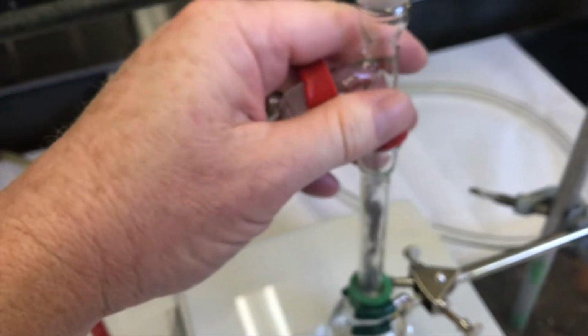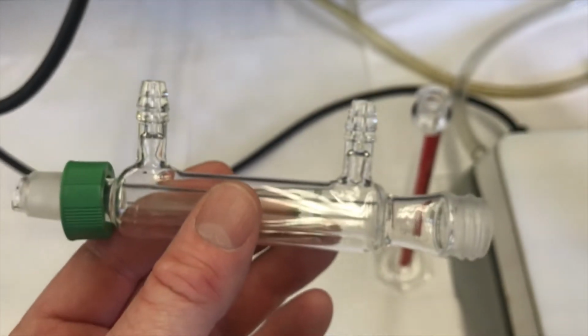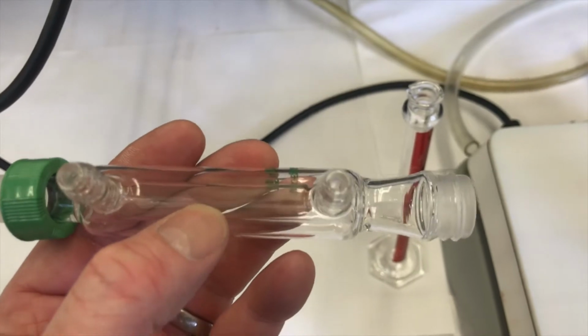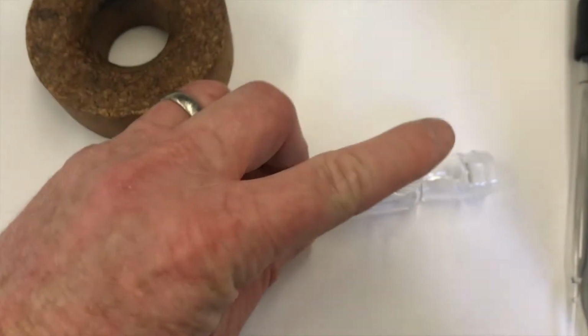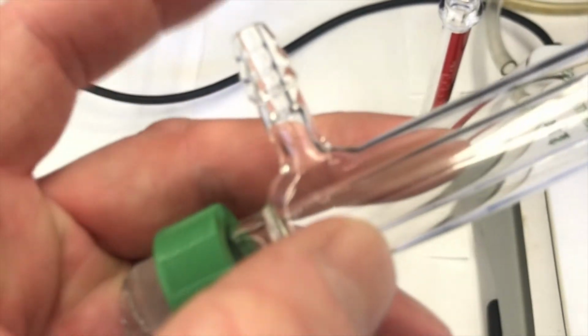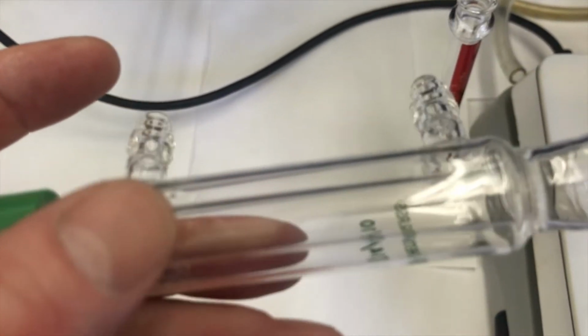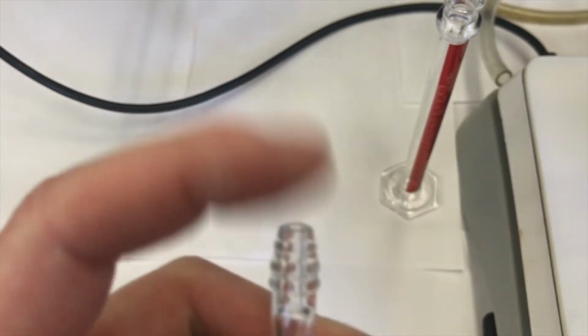Okay, and then on the side of my distillation adapter, I'll add my water condenser. Here's a water condenser. The water condenser is really interesting. So the way it works is water can go into that tube, that opening, right? Water can go into this opening right here, and when it does, it's in an outer jacketed area. The water will go on the outside of that inner tube, and then it'll come out this end.